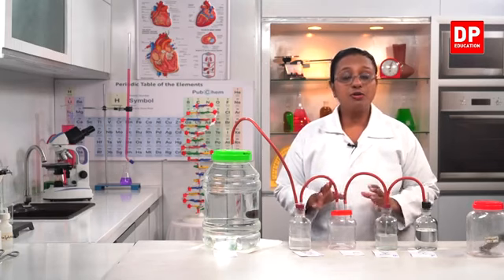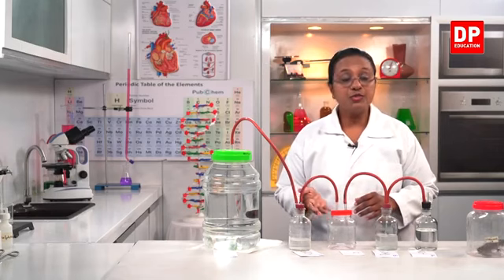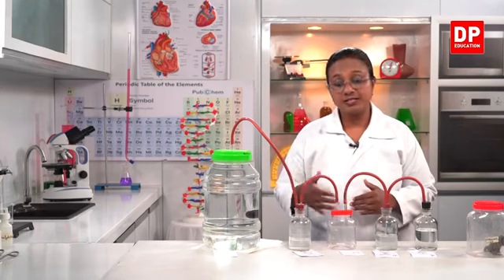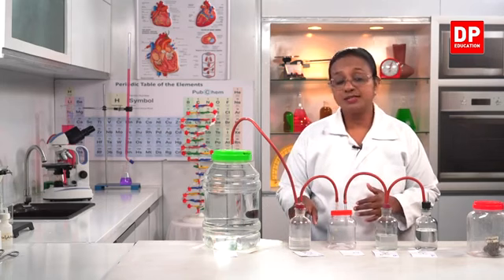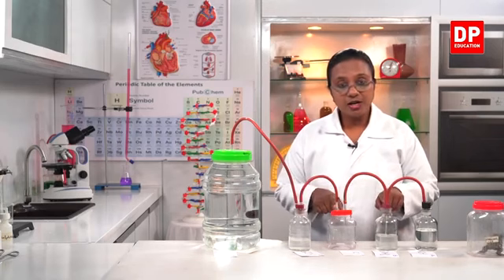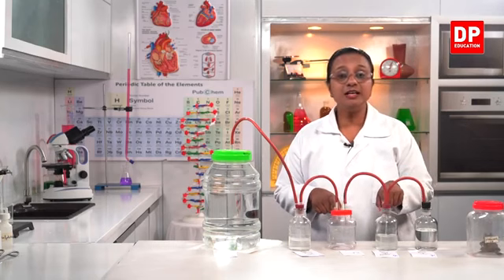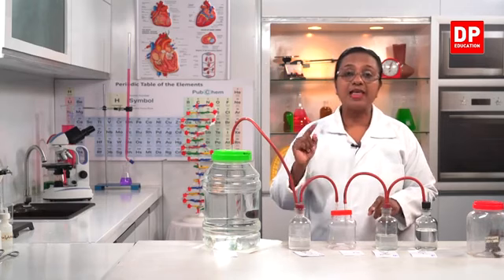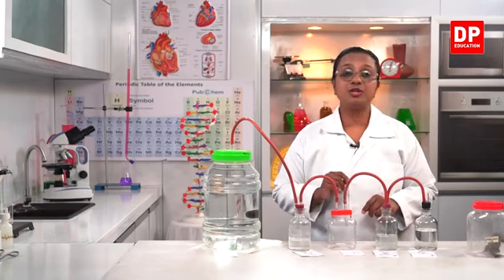Instead of the frog, you all know what we can replace it with. We can use a small rat, or we can use germinating green gram seeds. So those are the organisms that will respire. Again, inside bottle D, we have calcium hydroxide, that's lime water. So in 2 places, bottle B is to confirm that there is no carbon dioxide in the air, and then bottle D is to confirm that carbon dioxide was released during the respiration of the frog.